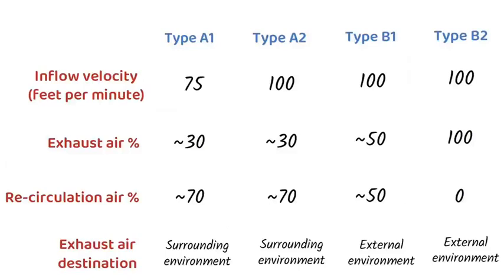Look at this table to find how these types differ from each other. The most widely used cabinets belong to the Type A2 of Class 2.